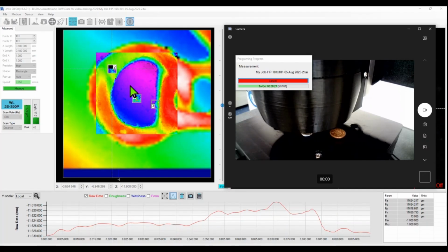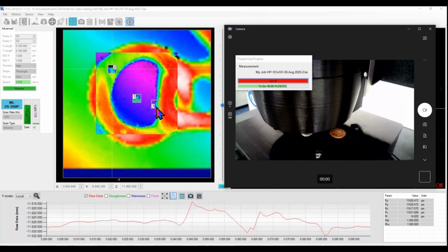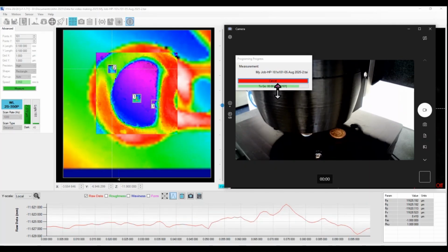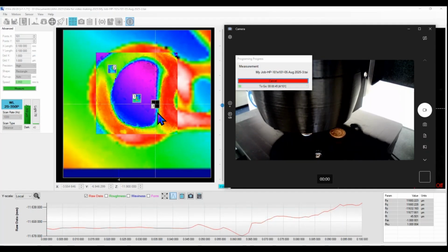As I said, I'm going to finish off. We'll look in a bit more detail at maybe one of these features in the BEX software analysis package, which is tied into the XYRIS instrument. So 8 seconds to go on this one. See the cross-sectional information beneath, and it's now moved to number 3.